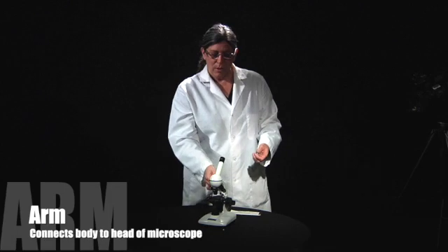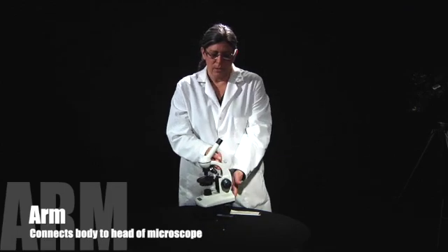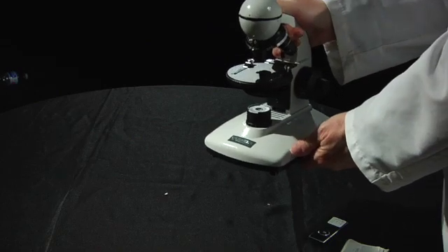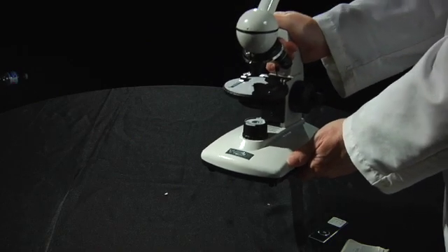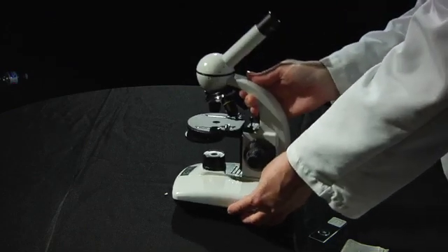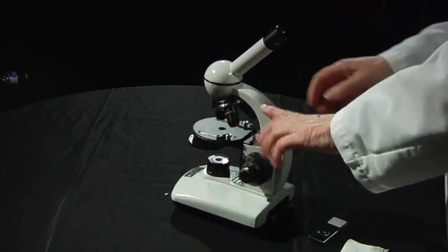The next part of the microscope that we're going to learn is called the arm, and we learn the arm because this is what you hold your microscope with. It's really best to hold it very firmly with your hand and with your other hand under the base.